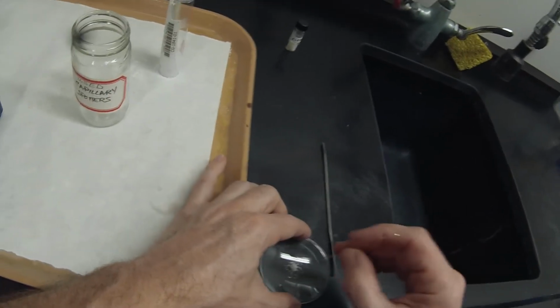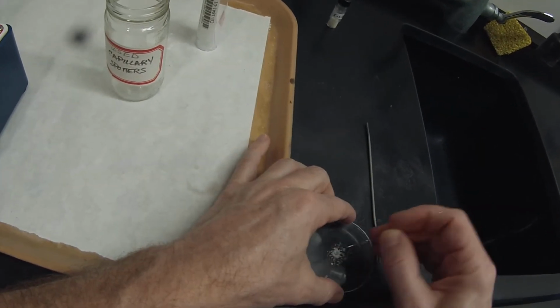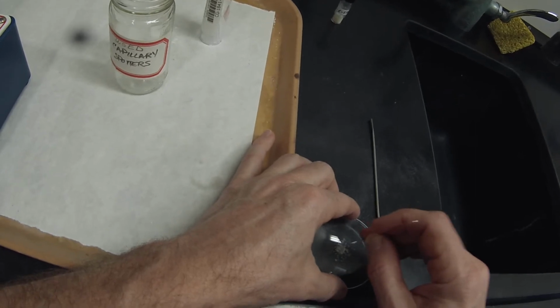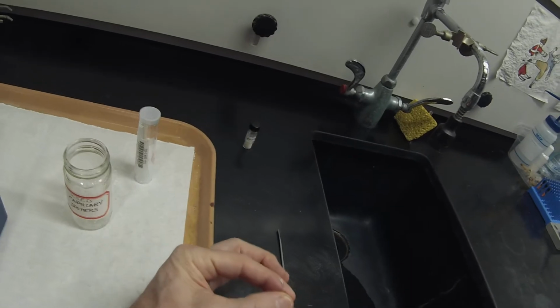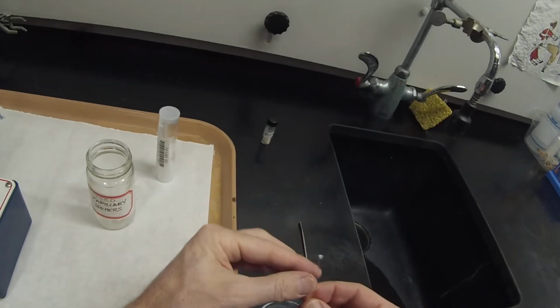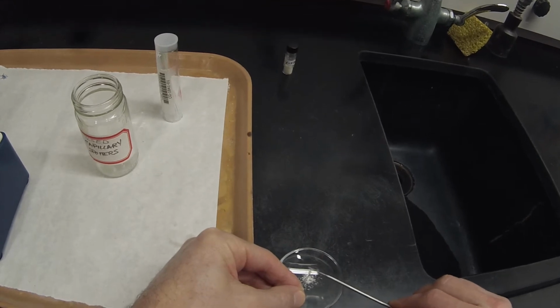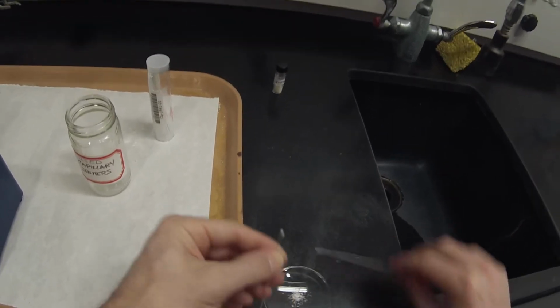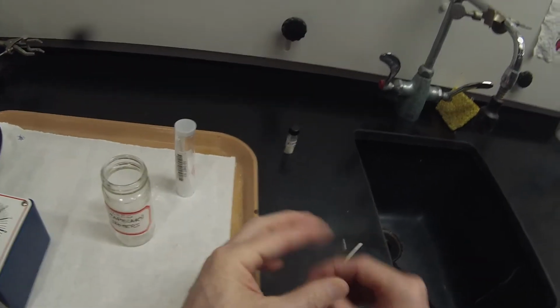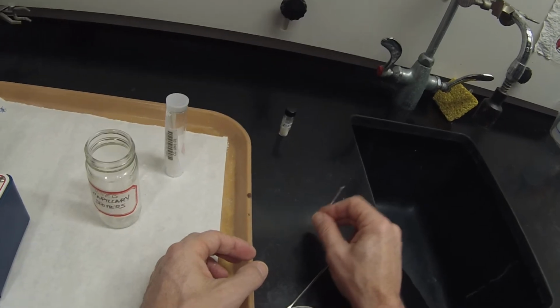Just going to take my melting point capillary and invert it and tap it on there a few times. And I'm shooting for like 3 or 4 millimeters of material. Pull that off the top. That looks pretty good. And I can just tap that on the bench top.